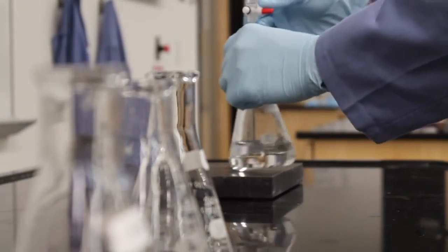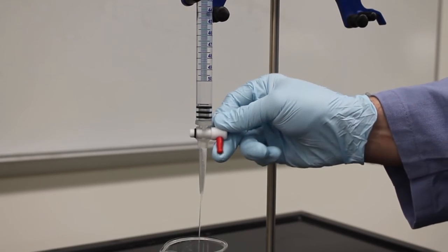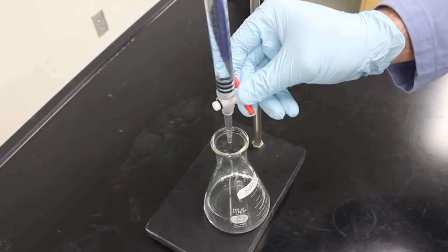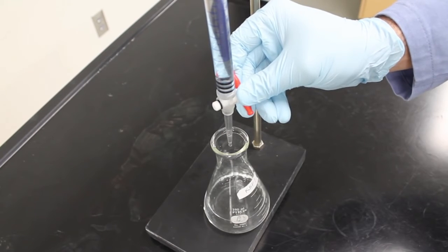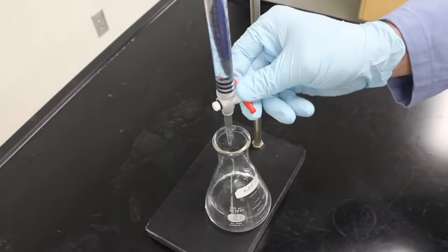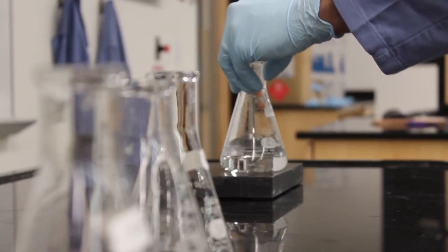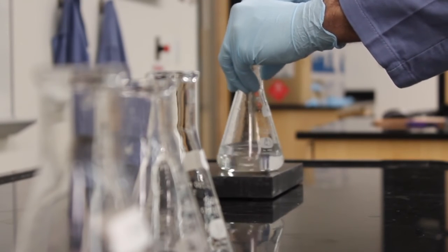Now we can start with our more precise titrations. My scout titration allows me to run the burette down to 13 milliliters before I need to start adding more slowly and eventually dropwise until I see a color change. You need to slow down 2 to 2.5 milliliters before the point that your scout titration indicated. This is because during the scout titration, it is very easy to over-titrate without knowing. This process can take a while, but in order not to go past your equivalence point, you need to take your time.